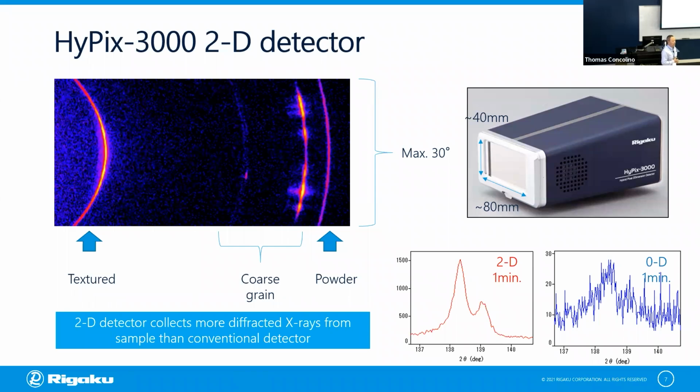I remember some of the professors discussed this before lunch, if I remember well. She was struggling to find the peak and assuming different crystal structures. If you have a bigger detector, all the diffraction spots are recorded by the detector, so it helps to find the peak. But the major reason for us in this specific example, micro-area residual stress measurement, is to collect more X-ray photons from the sample, because the X-ray beam is quite small. So we try to maximize the intensity from the small area.